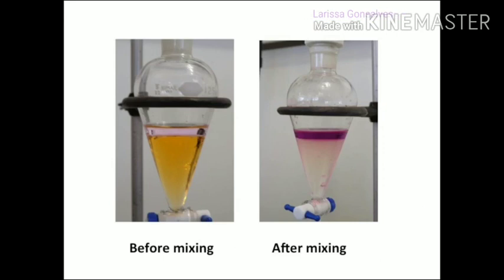The aqueous layer went from orange to colorless. This shows that the iodine left the aqueous phase. The paint thinner layer went from colorless to dark purple. This shows that iodine went into the paint thinner layer. In this video, iodine was extracted using thinner as a solvent. So this was all about solvent extraction. With this, we finish off your third chapter, that is some analytical techniques.